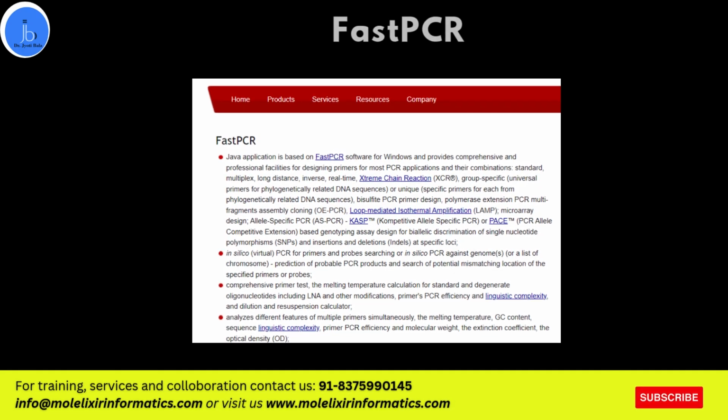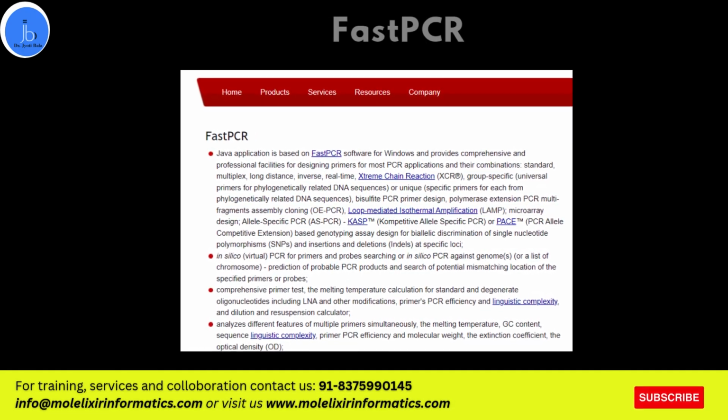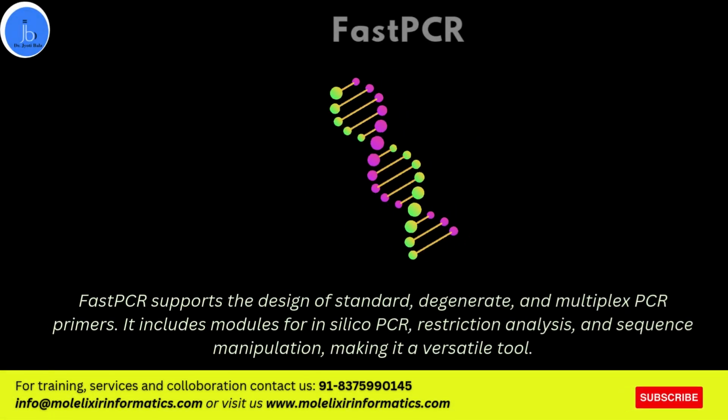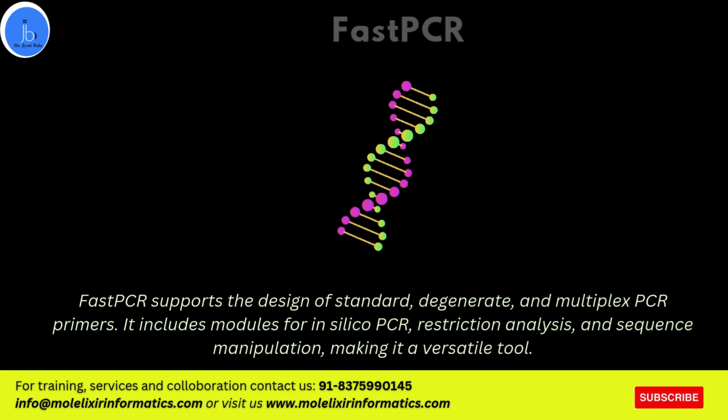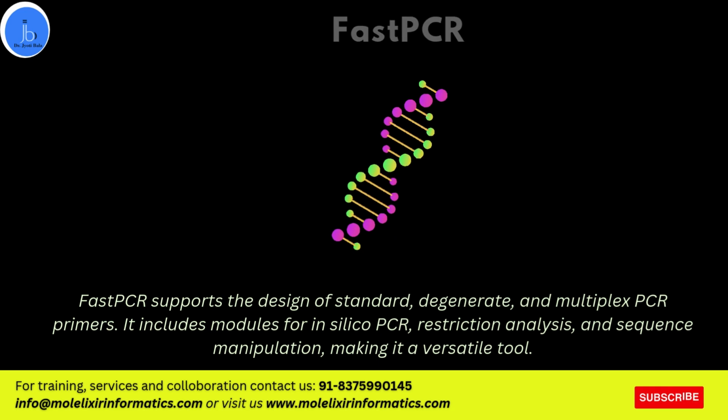The next one is FastPCR. This helps in designing primers for various PCR amplifications. This supports the design of standard, degenerate, and multiplex PCR primers. This includes modules for in silico PCR, restriction analysis, and sequence manipulation, making it a versatile tool.